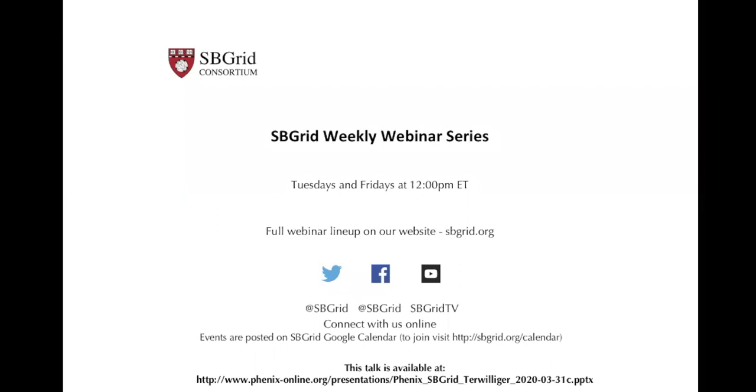Basically, if you have a low resolution model, lower than, let's say, 3.5 angstroms, it's not going to be able to figure out this is subunit A, this is subunit B. It won't do that well. It'll build a bunch of stuff and it won't know for sure what most of it is. If you have high resolution, better than 3, a lot of it will be assigned correctly to sequence and therefore correctly assigned to what domain is what.